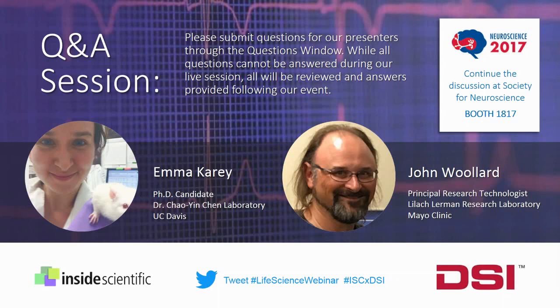You get different information when you do parsed segments. I know that it is more common to do parsed segments in frequency domain, at least as far as where I've seen it done. The reason for this is you can find a clean section of data within an hour, for example. You can find 30 seconds or a minute and say, okay, I'm going to use this as reflective of the whole hour, and then I'll just go on from there. And I think the danger in that potentially is that you are cherry picking.